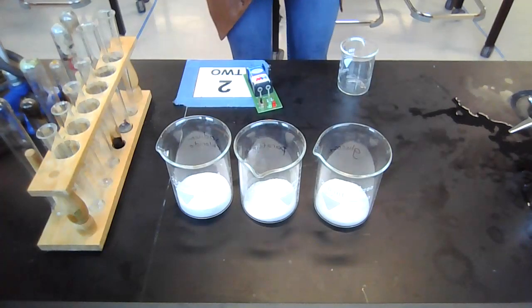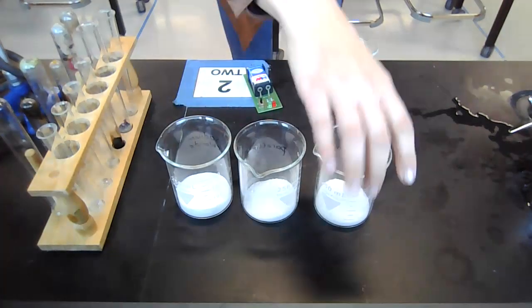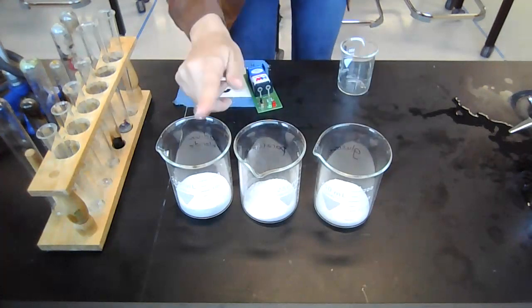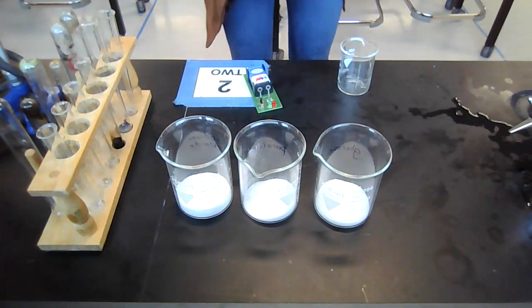Alright, I'm going to run you through the properties of solids lab. We have glucose here, so sugar. We have paraffin, which is wax, and then we have sodium chloride, which is table salt. So we're going to test the conductivity, solubility in water, and then relative melting points.